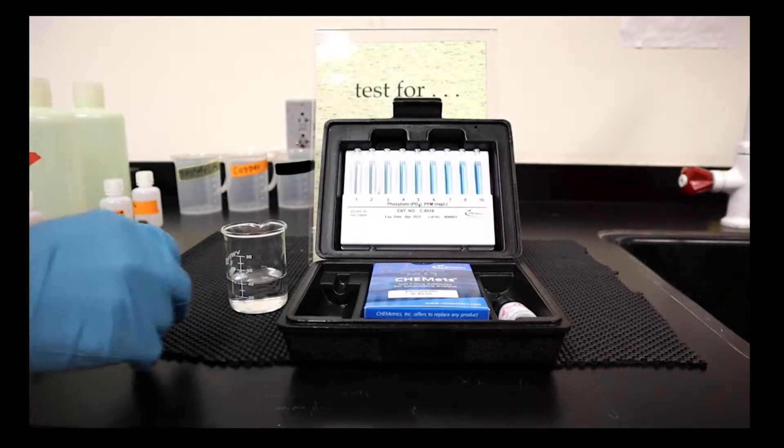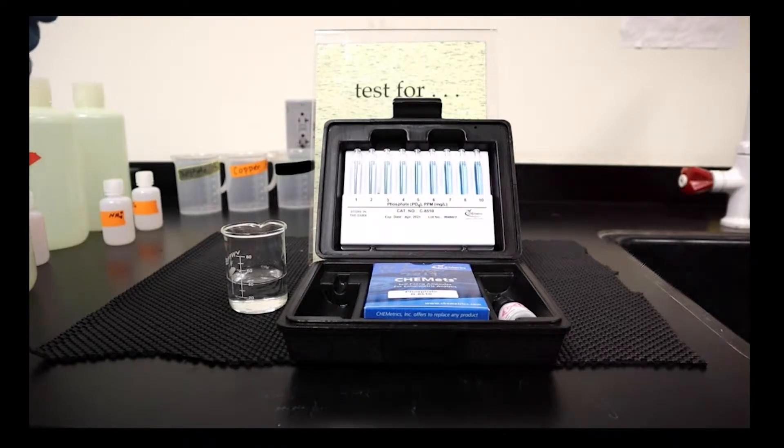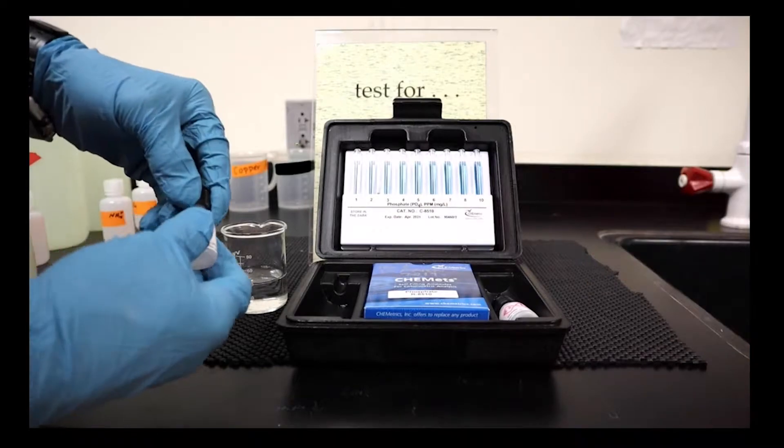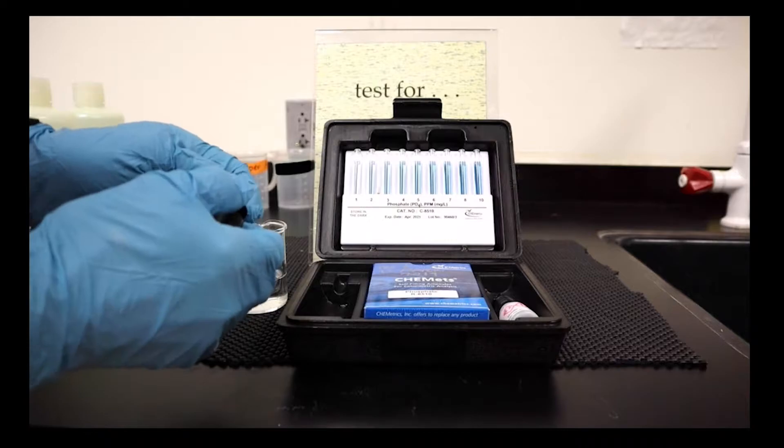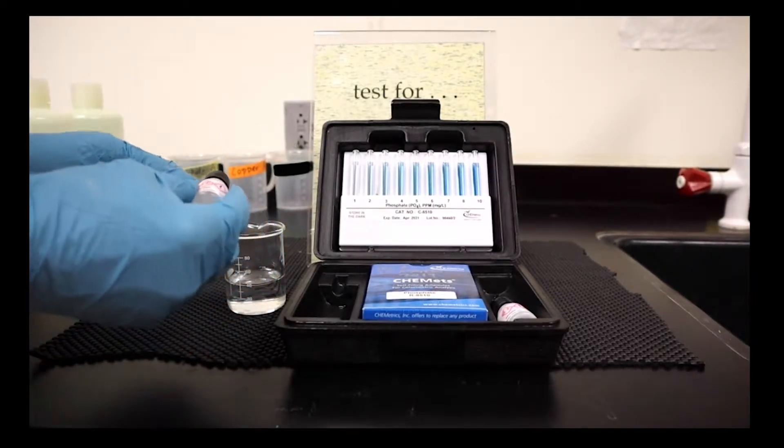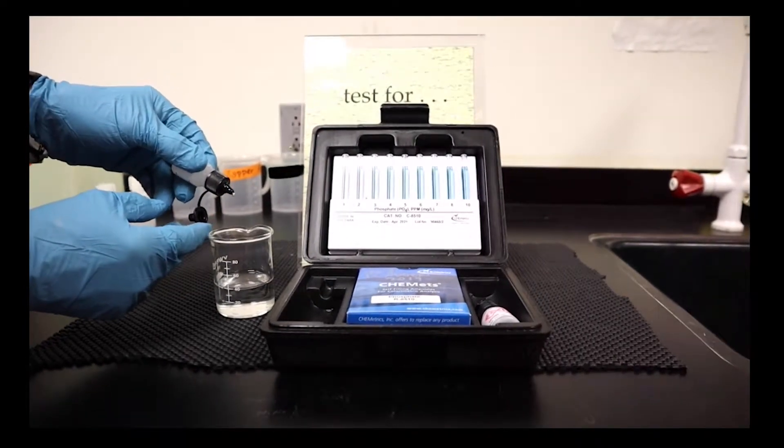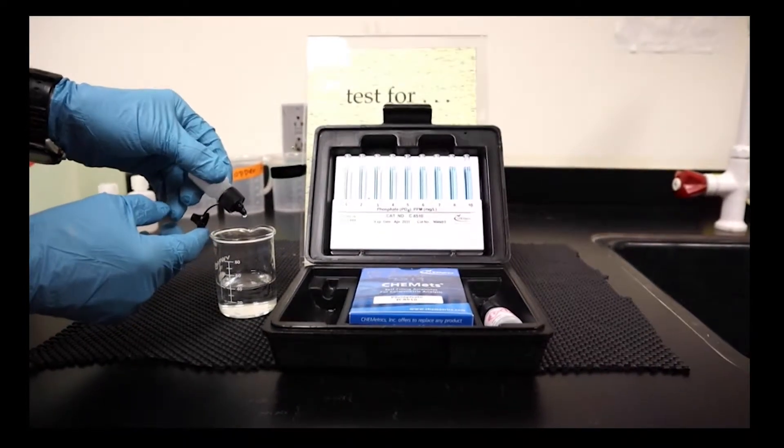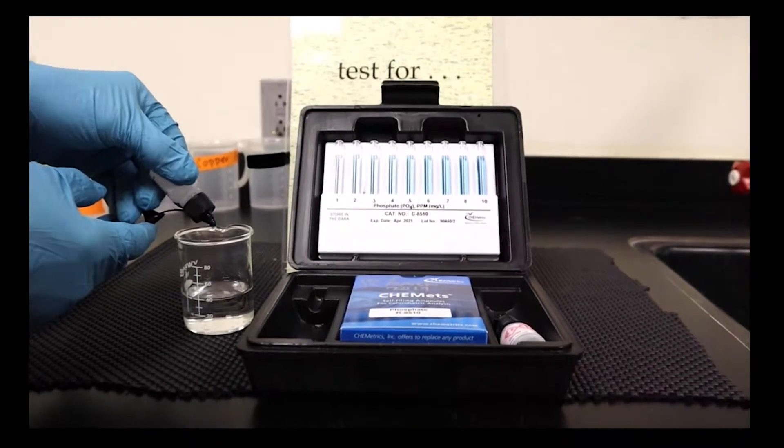Now we want to add two drops for every 25 cc's, we want to add two drops of this reagent. We've got about 40 cc's in this case, so we'll put three drops of reagent in there: one, two, three.